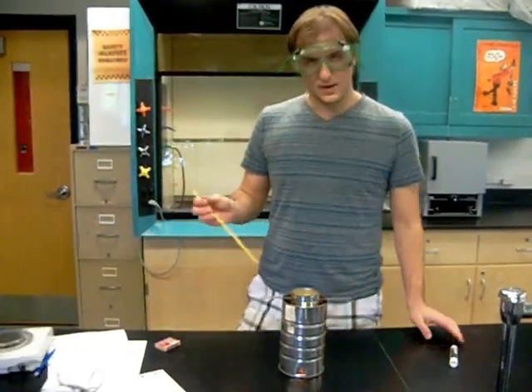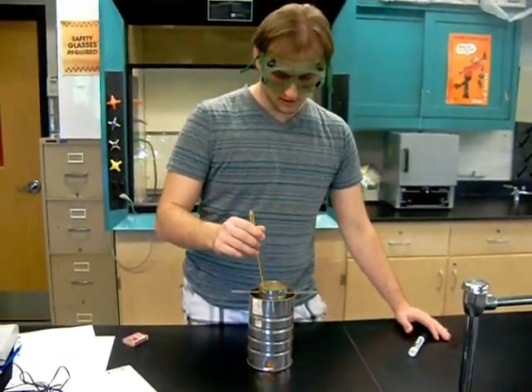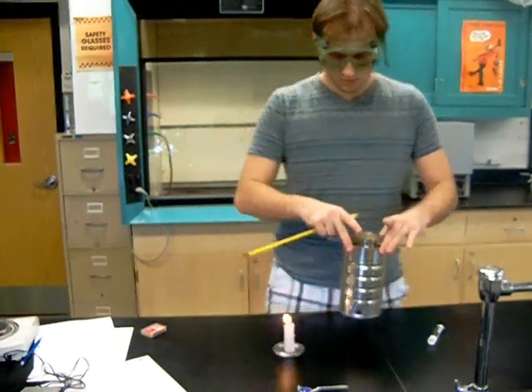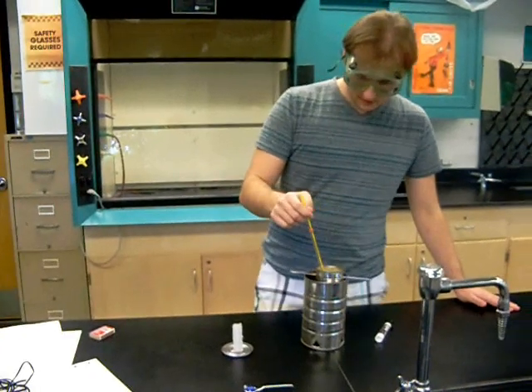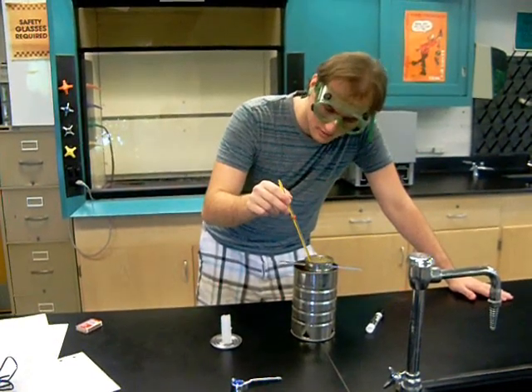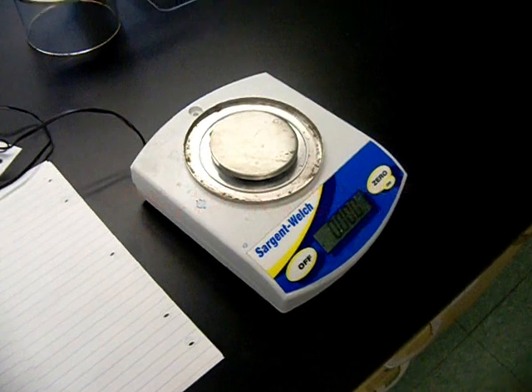So, right now we've been burning only for 3 minutes, but we only use a very small quantity of water, about 50 milliliters. So, at this point, the change in temperature is drastic. So let's first blow out the candle so we don't gain any more heat. And we'll measure that volume later. And the change in temperature we have with this water, we have went from 22 degrees Celsius, which was our initial temperature, and we are now at 60 degrees Celsius.